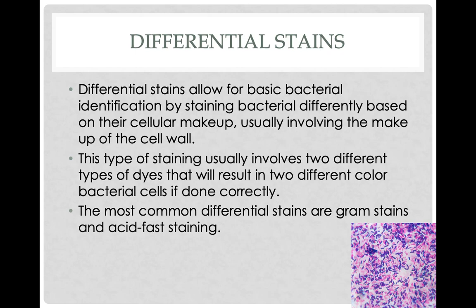so you might want to look at this one. So you guys can see down here in the corner, we've got pink and purple. This is a gram stain. So the purple bacteria uptake a different type of dye than the pink ones. So we can differentiate that, oh, it's different. Something's different here. Whereas if you used a simple stain, you would simply get the size, shape, and arrangement, and everything would come out blue. You would not be able to go, oh, there's two different species here. Everything would just look the same. It's all blue. It's all the same shape, all the same size.